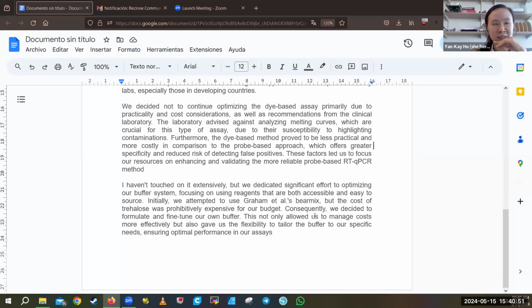That's fantastic, to be able to transfer the work that you've done in detecting SARS-CoV to detecting other diseases. So it's great to hear that those materials have been useful. I know that we were in a conversation with Jenny earlier on, and she was saying that we should look into scaling down a little bit and having a small subset of the most important and well-used enzymes, because I know there have always been a lot of requests for PFU, BST-LF and HIV-RT. So maybe we make a more curated set of ready-to-go enzymes to provide.